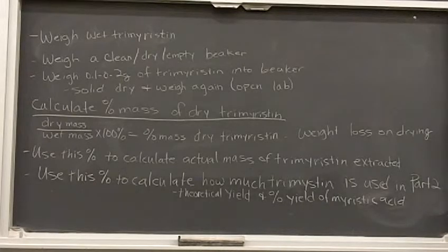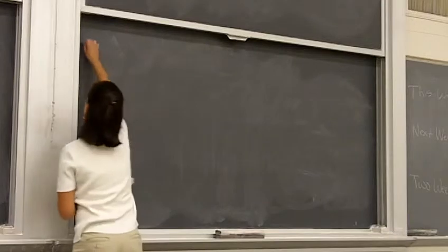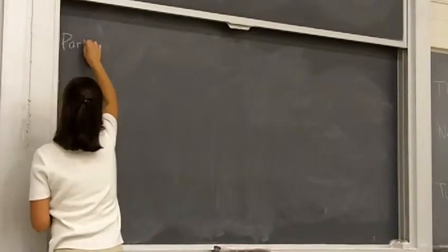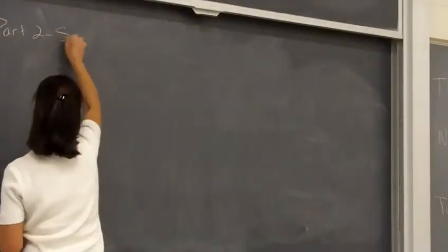So we're going to look at now what we're going to do in part 2, okay? So part 2, we're going to use what's called a saponification reaction.